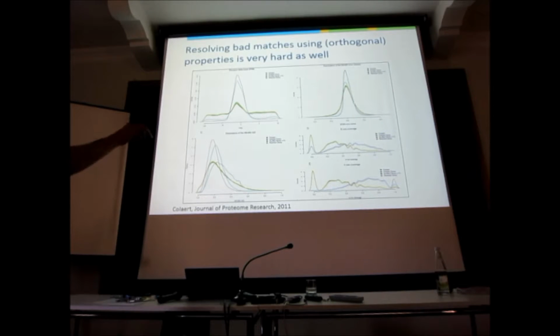None of these parameters is helping us. There's only one parameter that we could find that gives us a bit of an edge, and it's the arcane interquartile distribution on the MSMS mass error. It's the consistency with which the error moves in the MSMS spectrum. And this is in an ion trap. And what you can see is that the traditional decoys are much worse. Here, by the way, there is one shuffled guy that is very strange. You see the original one and you see the Photoshopped ones, and the Photoshopped ones are different. That's the only thing we could find.